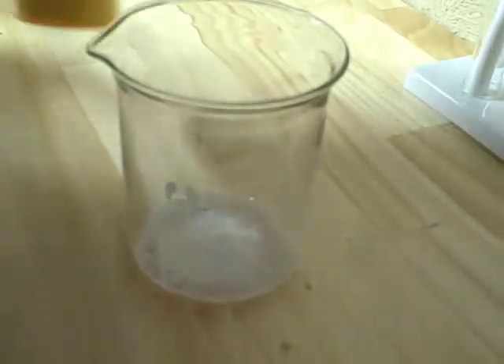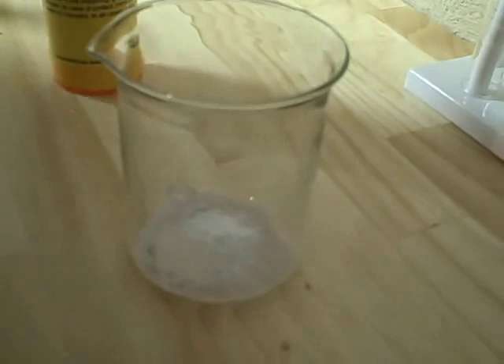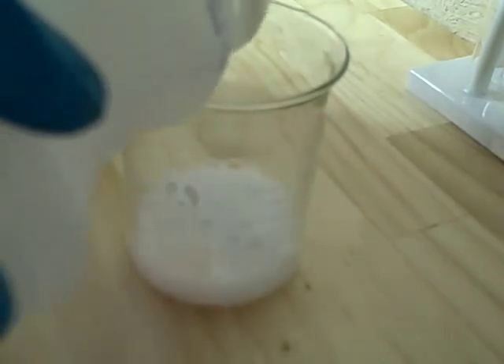After that you're going to have to take your vinegar and just continue adding it until it doesn't produce carbon dioxide bubbles anymore. Add it slowly so it does not foam over, so I'm going to add a little bit of water.